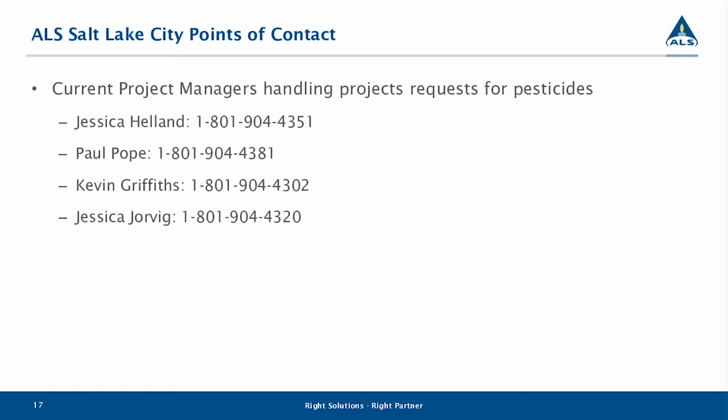Oh, Jessica, one question. For the wipes, should the samples be sent in clear or amber glass? So we are okay with either. That question probably comes from the fact that in soil and water sampling, I believe amber is recommended for most pesticides. The recommendation is to keep them still stored away from light and ship them in something like a cooler. So even though you don't necessarily have to use amber glass when shipping them, the recommendation is still once you've sampled to try and keep them away from light and heat.